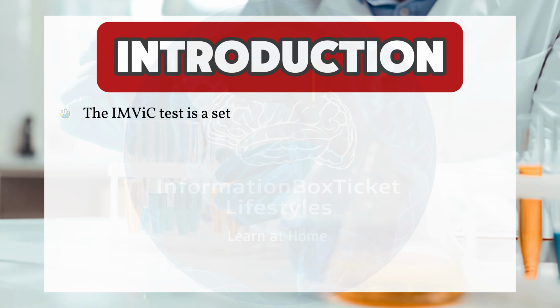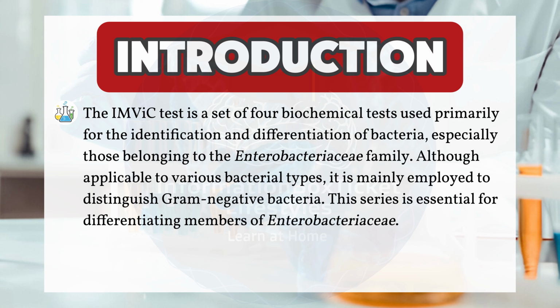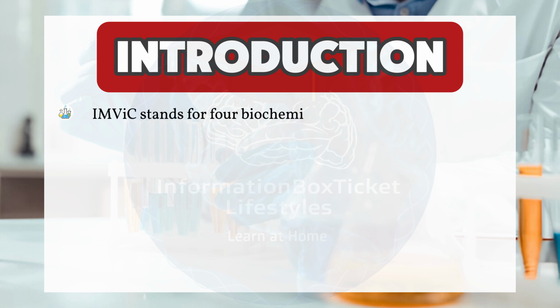Introduction. The IMViC test is a set of 4 biochemical tests used primarily for the identification and differentiation of bacteria, especially those belonging to the Enterobacteriaceae family. Although applicable to various bacterial types, it is mainly employed to distinguish gram-negative bacteria. This series is essential for differentiating members of Enterobacteriaceae.